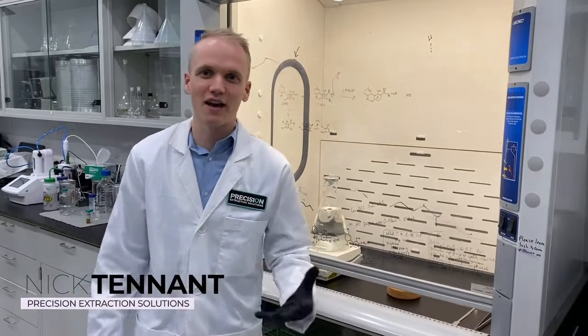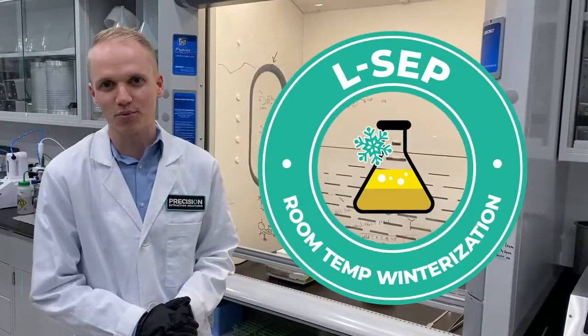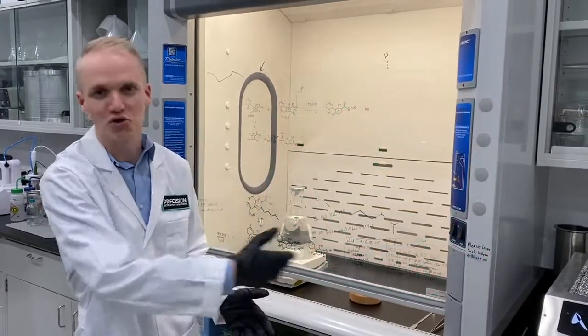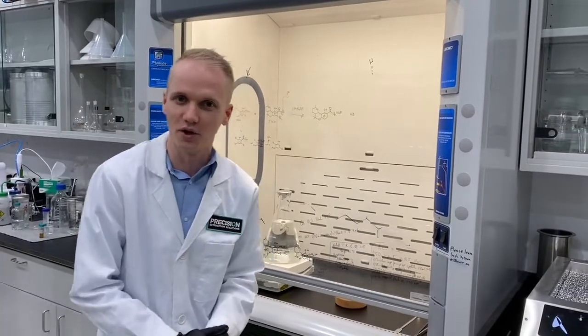Hey guys, Nick with Precision here. Today we're trying out our all-new LSEP instantaneous winterization process. We're not only going to tell you a little bit about the process, but we're also going to walk you through it, show you around the lab a little bit, and actually show you the experiment in real time.